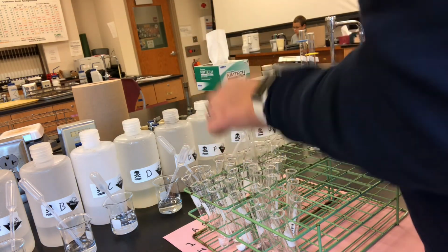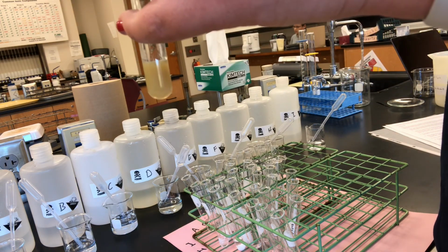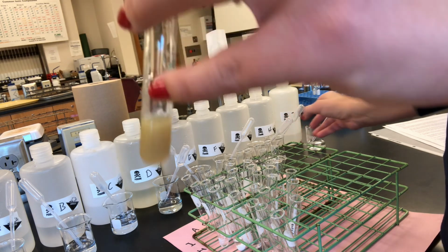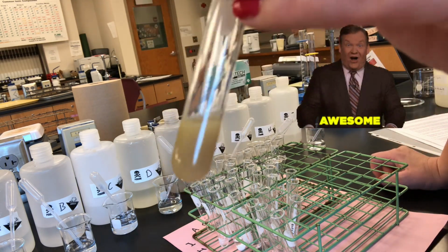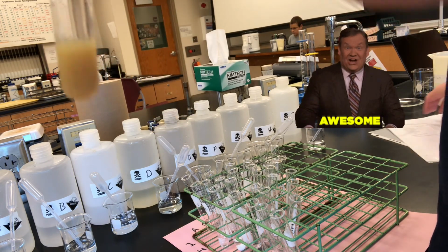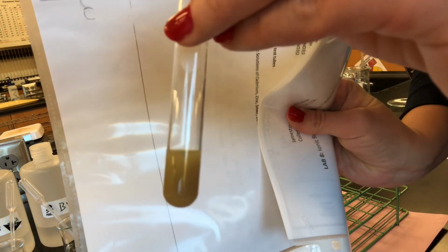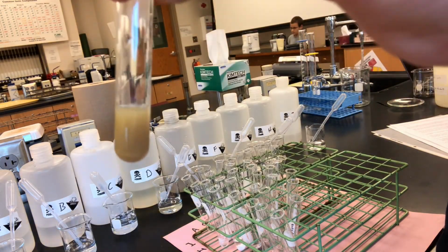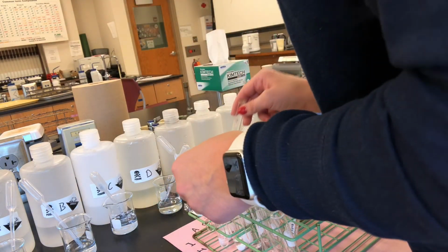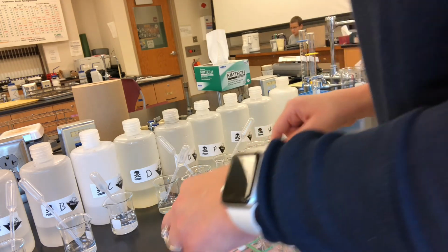E and H. Ooh, there we go. That is definitely an orangey brown, rusty color. Sorry, I keep moving out of the camera. Orangey brown rust color. Does this help at all? No, not really at all. All right. Okay. What was it? E and H give us an orangey brown rust color.